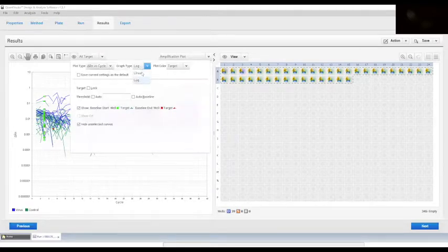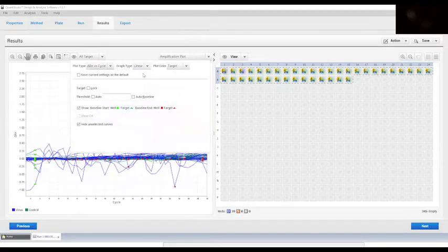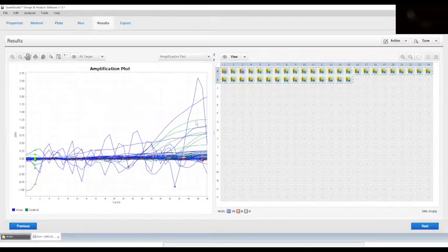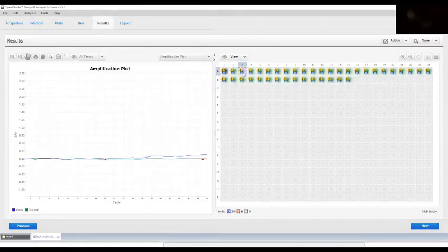Change the graph type to linear to see the amplification in a better way than you can see in this case.